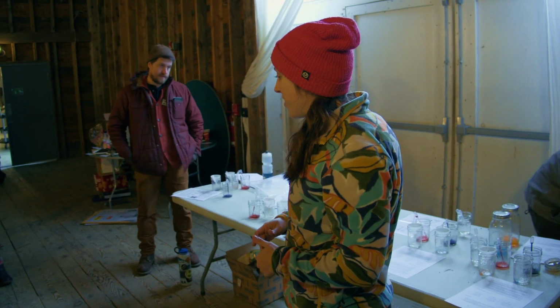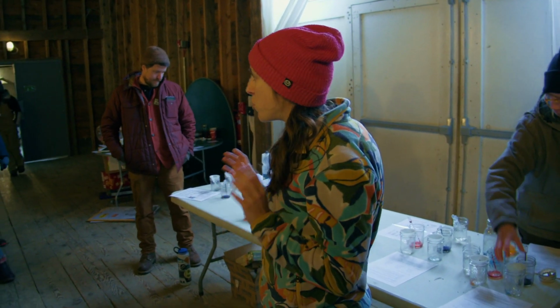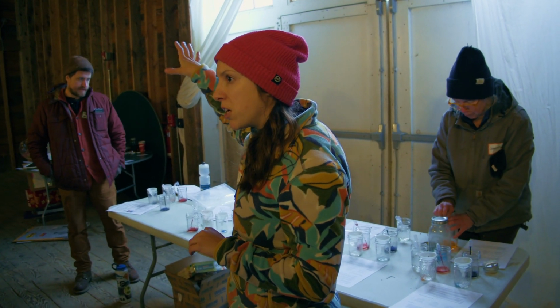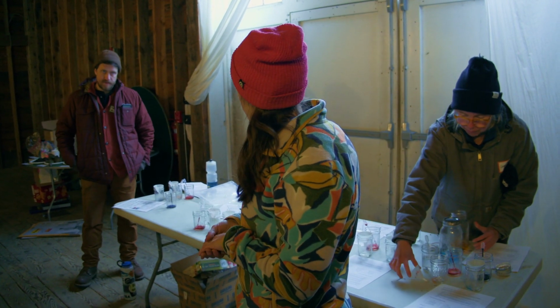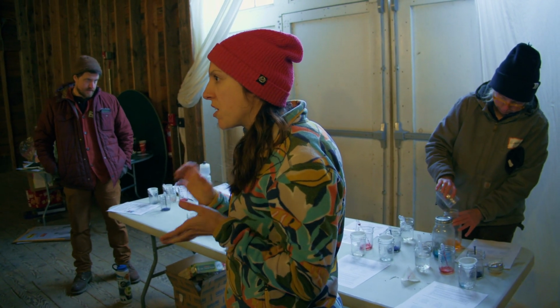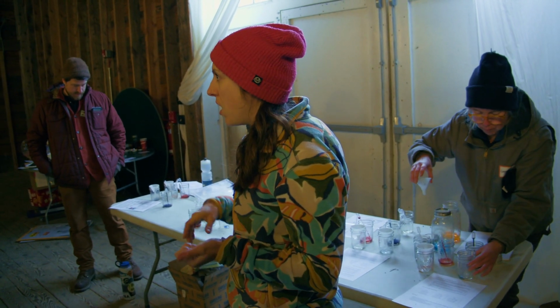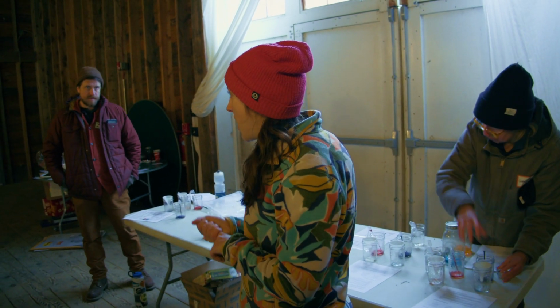So we have 3 different types of soils here today. We've got a soil collected from the roadside that's kind of coarse textured, and then we have 2 different soils collected from different gardens here at the farm. One's from a more uphill area, and one is from slightly downhill of that, and it definitely seems like they have slightly different textures. So we're thinking that we'll probably see a difference between these soils in their texture, and also their ability to retain both cations, so positively charged ions, and negatively charged anions.